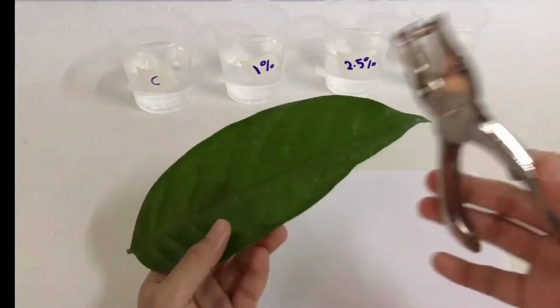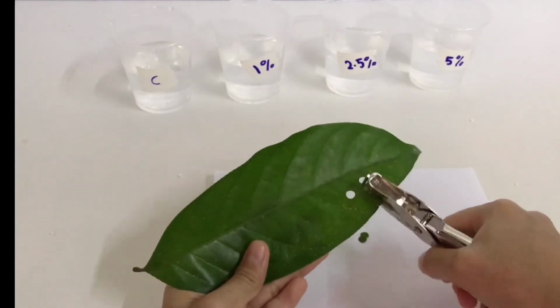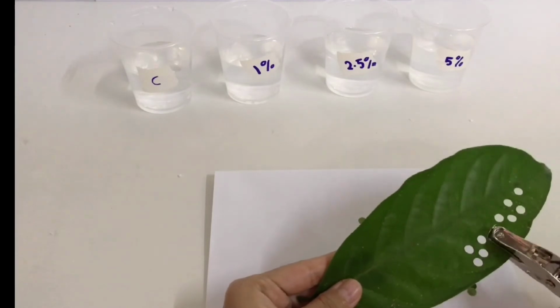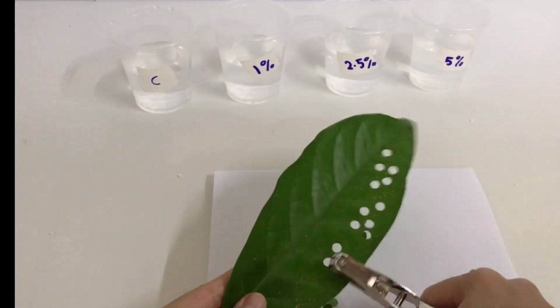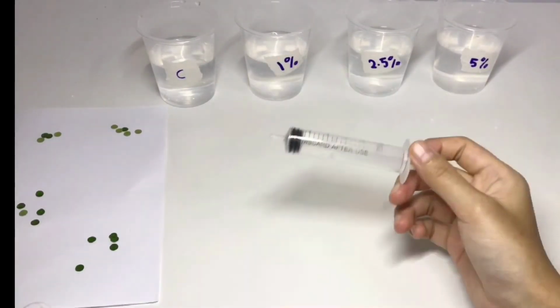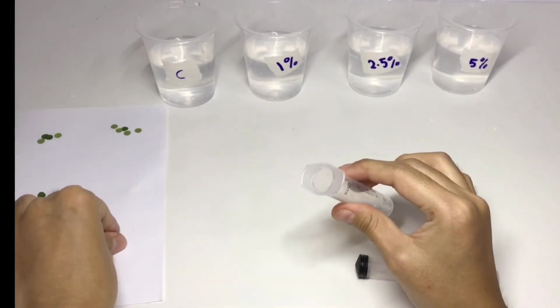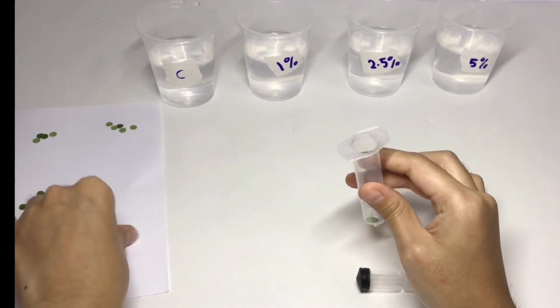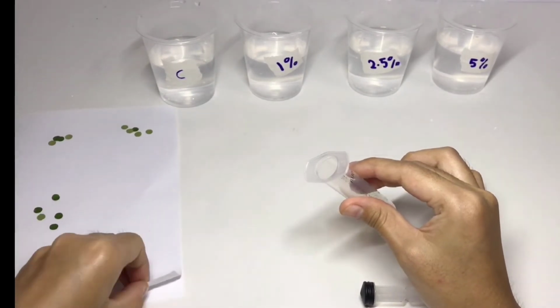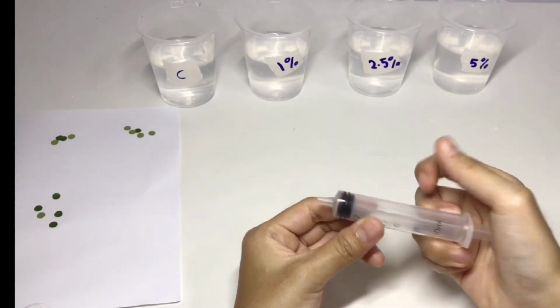Next, prepare 20 small pieces of fresh leaves using a paper puncher. We are going to use 5 small pieces of fresh leaf for each beaker. Take the 10 ml syringe and put 5 small punched leaves inside the syringe. Fill the syringe with distilled water half way through and you shall see the leaves float.